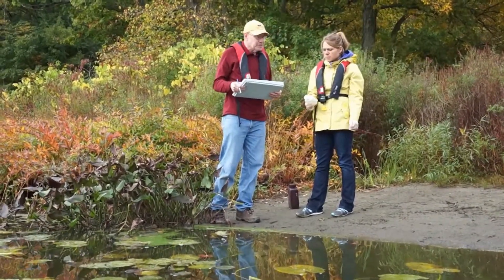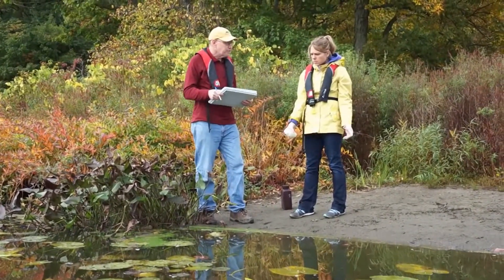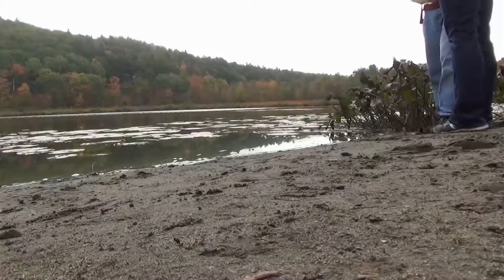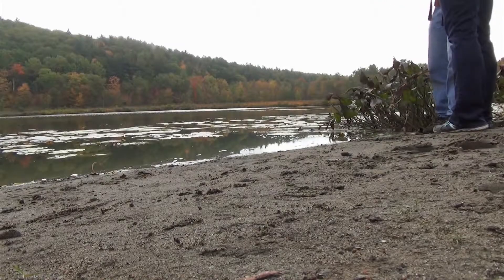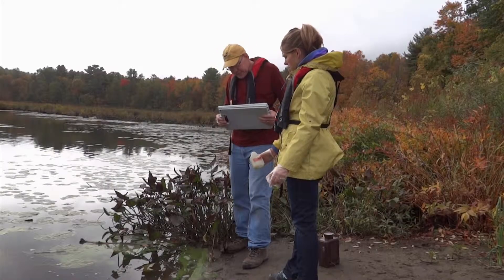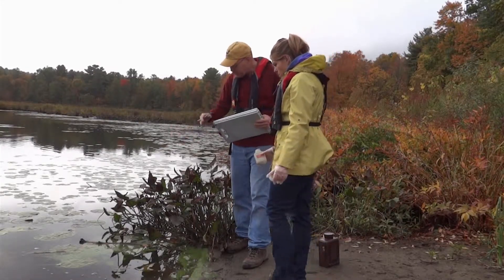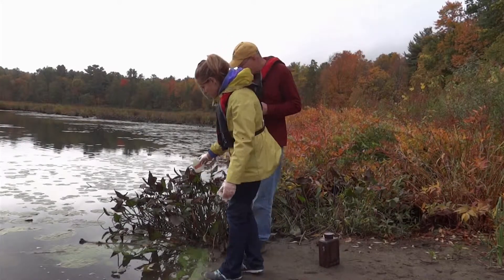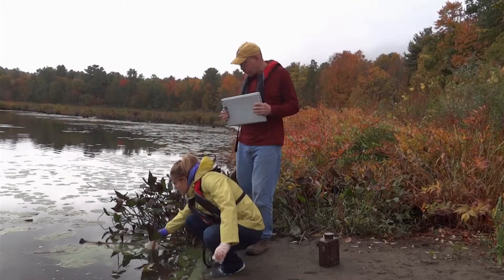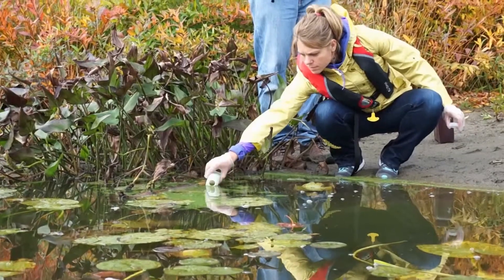The next step in the process is identifying where and how to collect an algae bloom sample. You'll want to collect a sample from the most intensive part of the bloom in a location where you're not compromising any safety. Right here along the shoreline, we have a good location. What you'll do is reach into the water and skim the bottle across the surface of the water, trying to get as much of the algae sample as you can, but also getting a fair amount of water so that it can be easily analyzed.